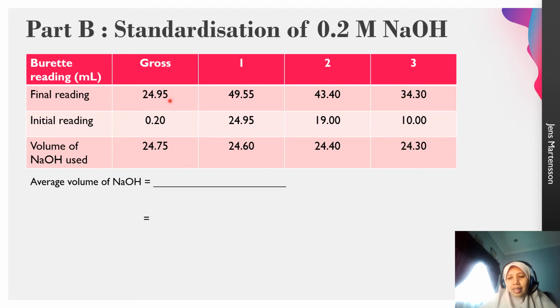And look at the last number. The last number is either 5 or 0 only. Yeah, 5 or 0 only. I think I have explained this last week. Okay, kenapa? Why 5 and 0 only? Nothing in between. We don't have 24.77. No. Yeah, that is for the volume.